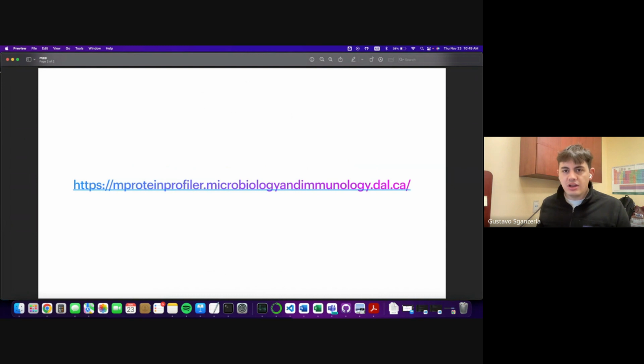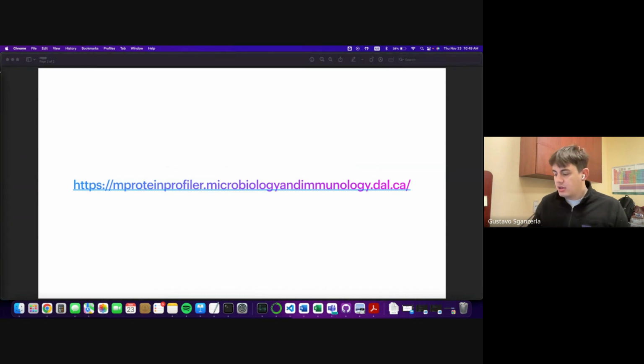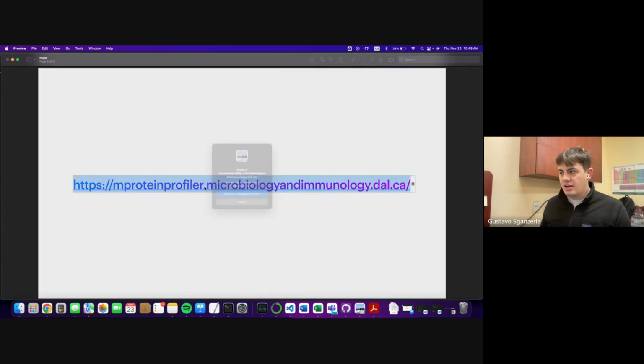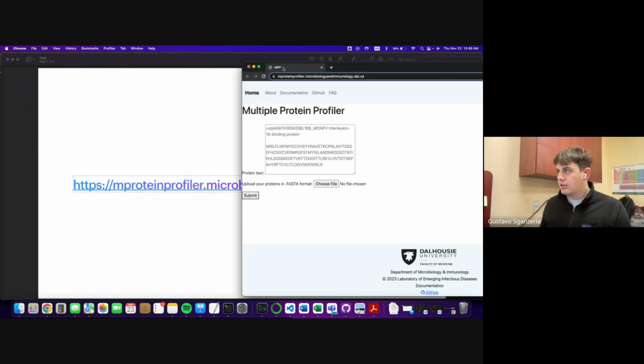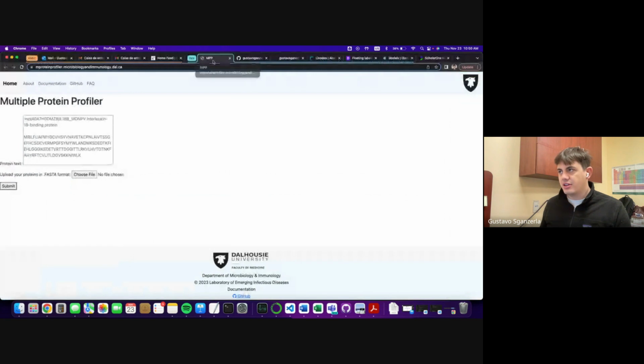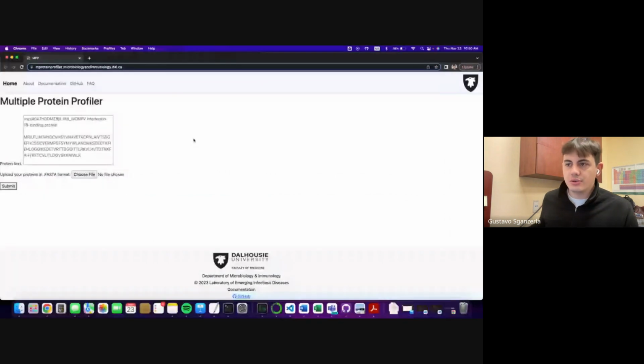Our tool is located here at mprotein profiler dot microbiology and immunology.dal.ca. Upon accessing this URL, we find the homepage of our tool.